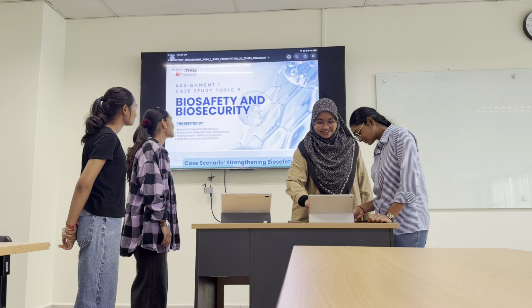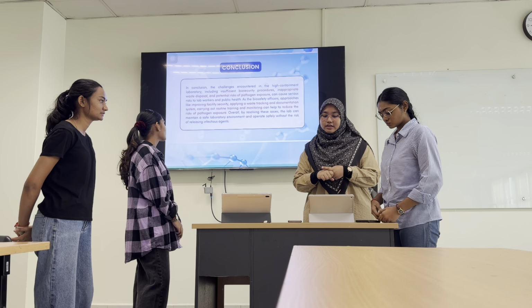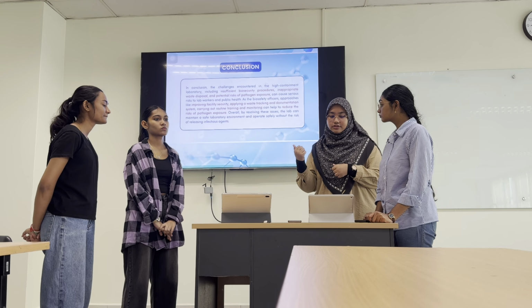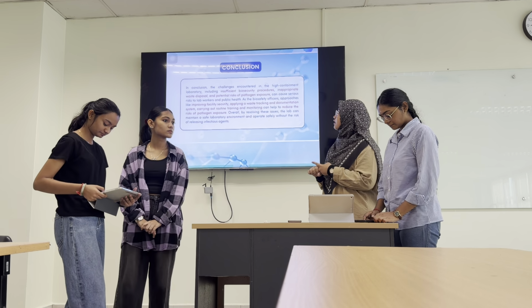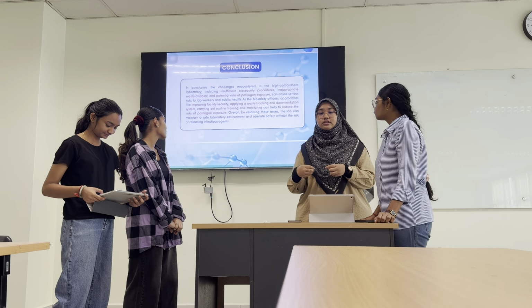laboratory, including some insufficient biosecurity procedures, inappropriate waste disposal, and also potential risk of pathogen exposure, can cause serious risk to lab workers and public health. So, as the biosafety officers, approaches like improving facility security, applying a waste tracking and documentation system, carrying out the routine training and monitoring can help to reduce the risk of pathogen exposure.